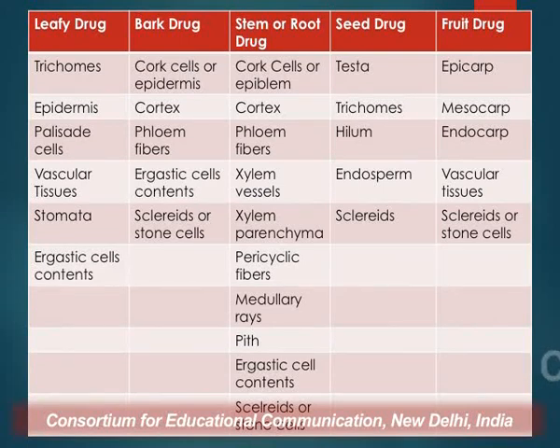Then in bark drug, we study about the characters of the cork cells, whether they are thin-walled, thick-walled, single-layered, multi-layered, or if epidermis is present, what are the characters of the epidermal cells.